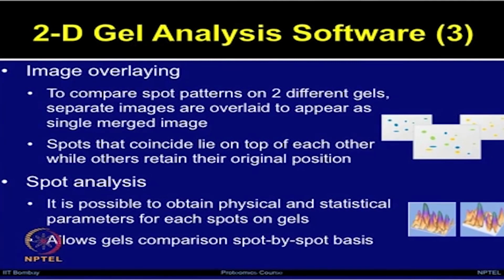Often, running a gel or acquiring images and generating a lot of data is much more straightforward as compared to doing the analysis, which is a more tedious step. One has to really sit and go through the gels, usually spot by spot, to analyze them.